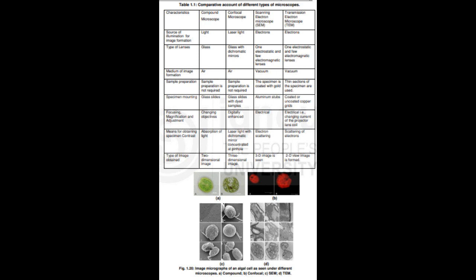1.4.1 Negative staining. Negative staining method is used for examining very small objects. It is generally used in TEM. The shape and surface characteristics of intact organelles or viruses can be examined using this technique.